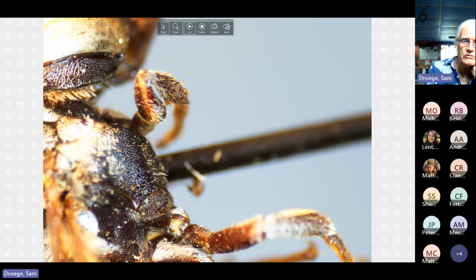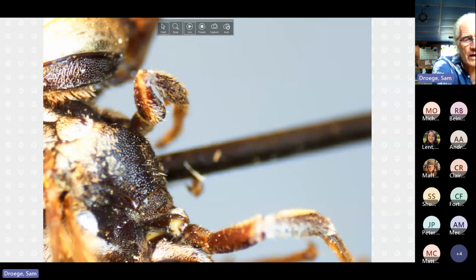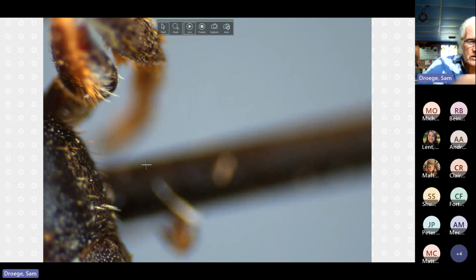One is long, and she uses the ocellus as a measurement tool rather than having to actually have a microscope that could physically measure what those distances are. But these are noticeable hairs sticking out from the side. And maybe we'll play with the thing here. And they're not many, and they're just scattered down, and they're only at the lower edges.